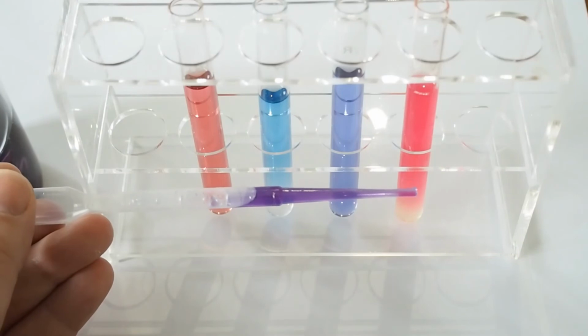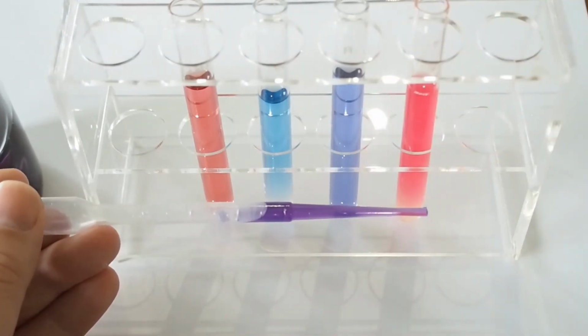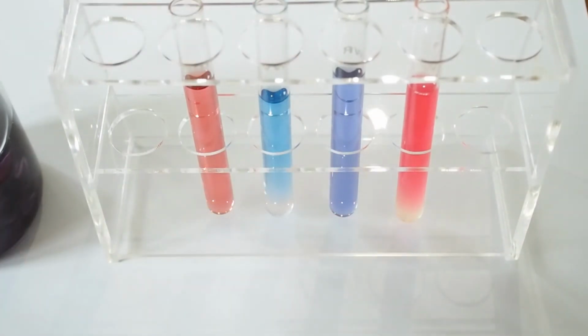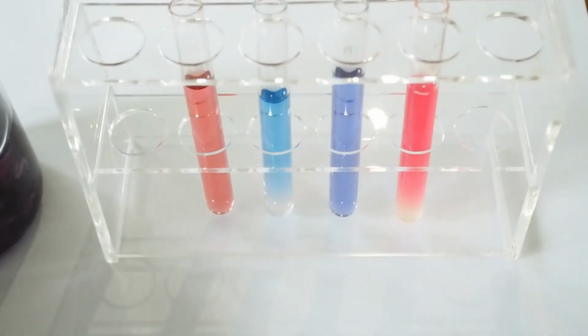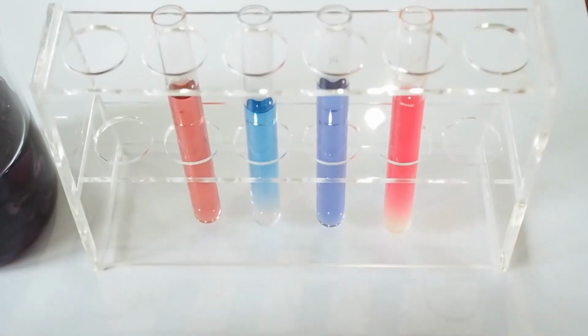I do think that when I put my thumb over and shook the water one, maybe had a bit of the base from here, and that's why it's gone a little bit of a more bluey colour, because it should just be a nice purple. So that's how we can find out whether something's an acid or a base.